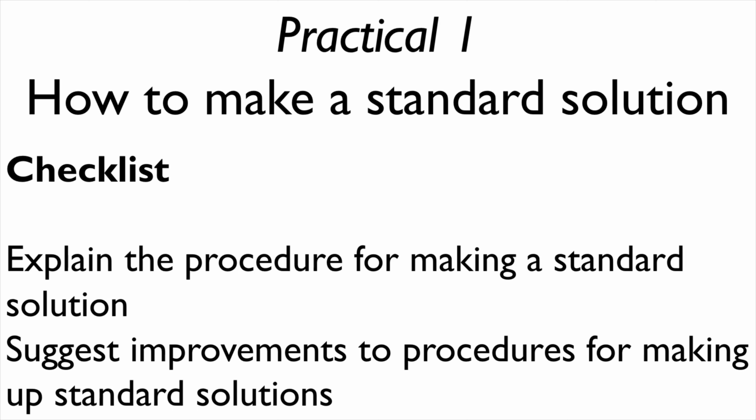Hello, so today we're going to be looking at how to make a standard solution. This is the first video of a practical series of videos I'm going to put together, but this also overlaps with the amount of substance topic.